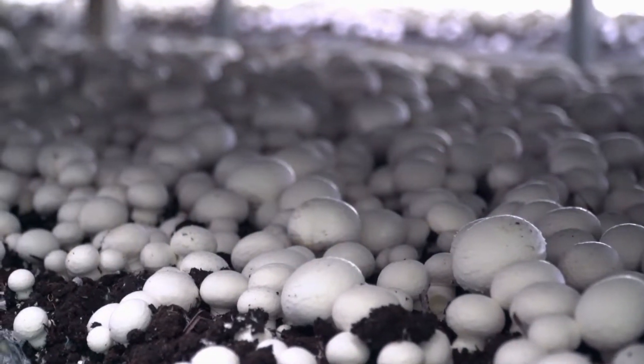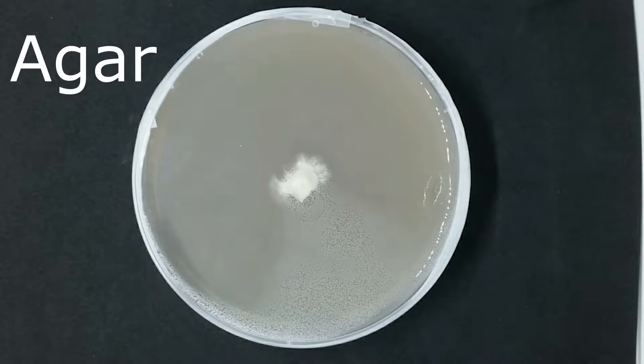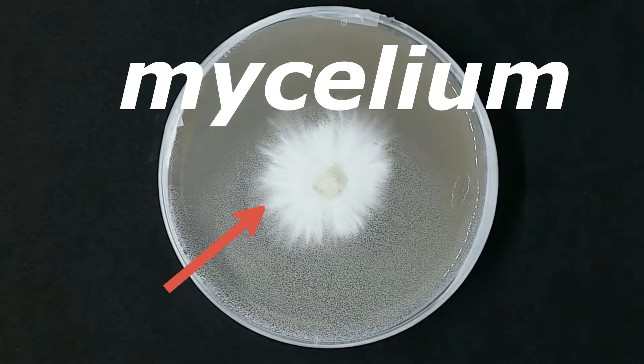You grow mushrooms through spores or through cloning by using a piece of the mushroom tissue. These spores or tissues are placed inside a petri dish with a clean growing medium such as agar and a little nutrients such as malt. If all goes well, the mushroom roots known as mycelium will start to grow.